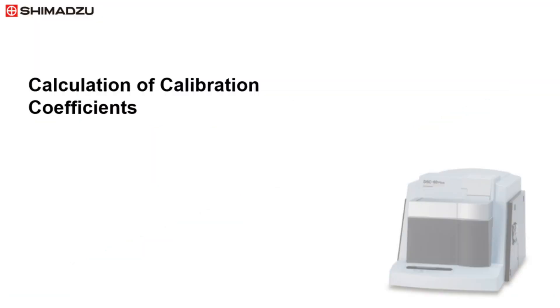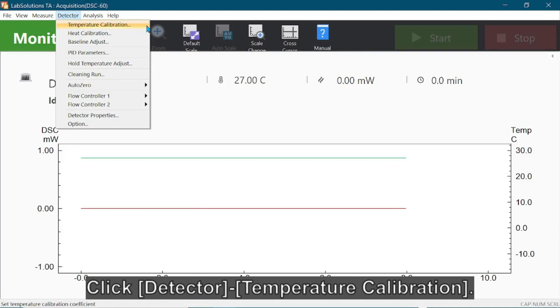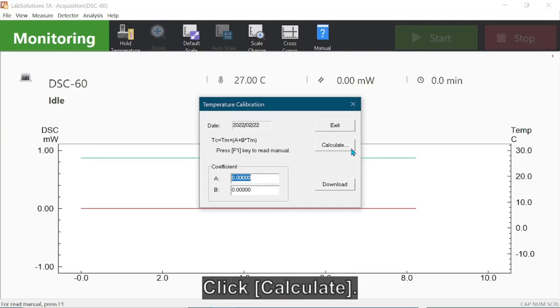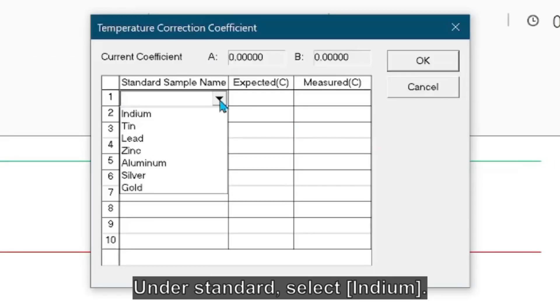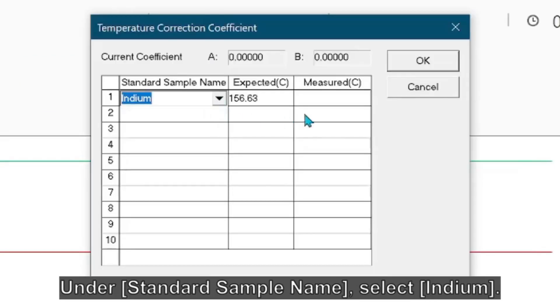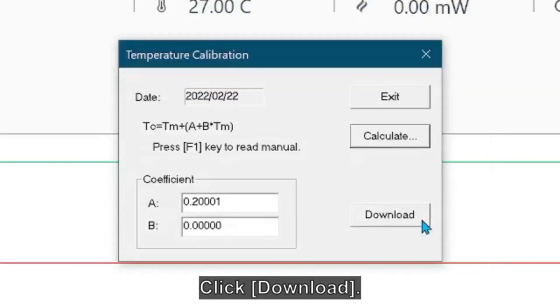To calibrate the DSC, the LabSolutions TA software is used to calculate the calibration coefficients. Open LabSolutions TA start window. Click Detector and select Temperature Calibration, then click Calculate. Under Standard, select indium. Enter measured temperature from indium and click OK. Click Download to update calibration coefficients.